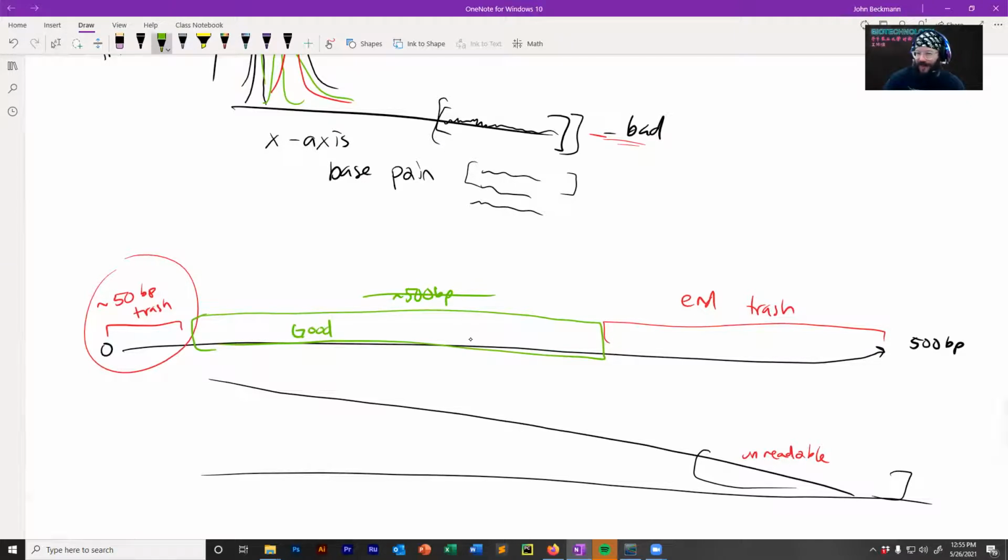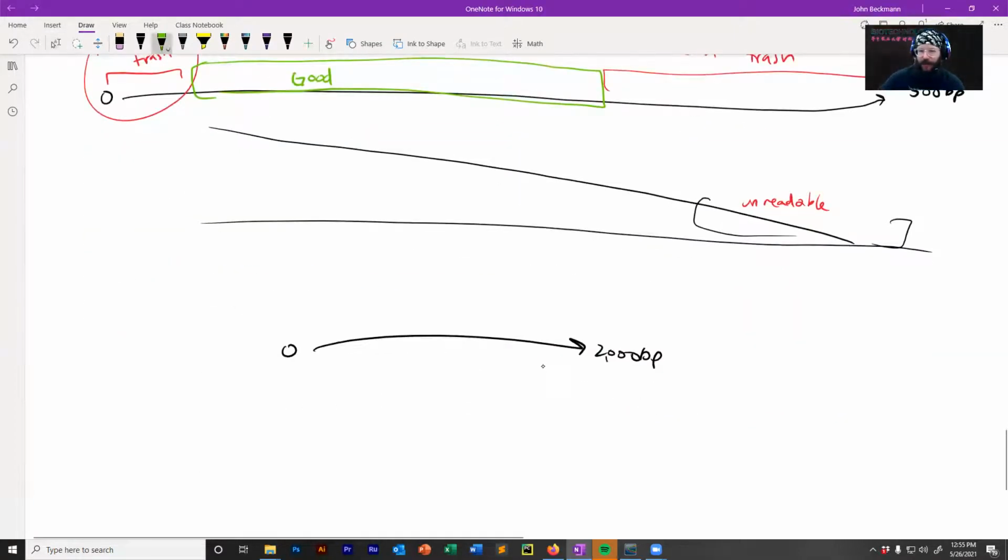I actually visualize it by how many lines of text. It's usually about 10 lines of text in a paragraph format that you get. That's good data. I don't actually know how many base pairs there are, but it's important to know that if you were going to sequence a long gene, you would have to string Sanger reactions using different primers together such that they would overlap so that you could get the sequence of this whole insert.